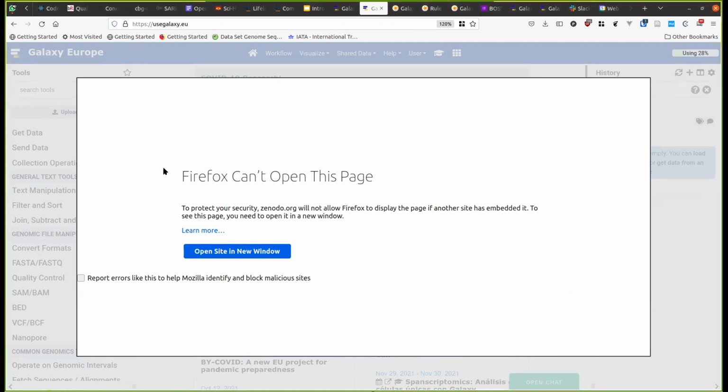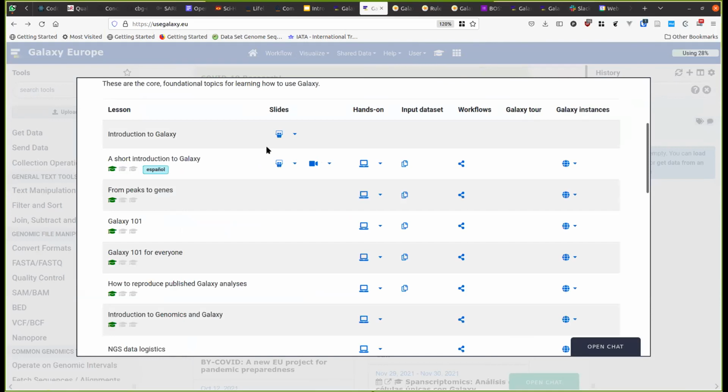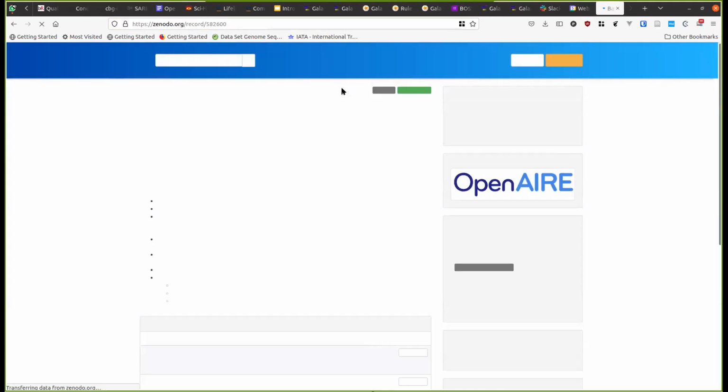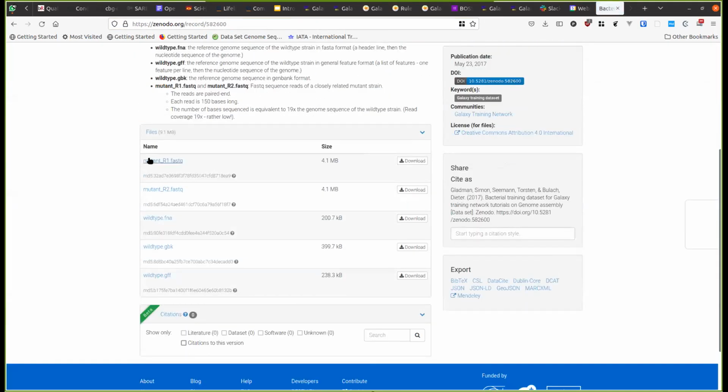Sorry. I'm going to see if I can reset back. It didn't copy, so it's just a link here. So the link to the input data sets, and I can say copy link, and that is the link to where we find the input data. If we click on that, I'm going to get another error now, I'm sure. This is the collection of input data, okay?